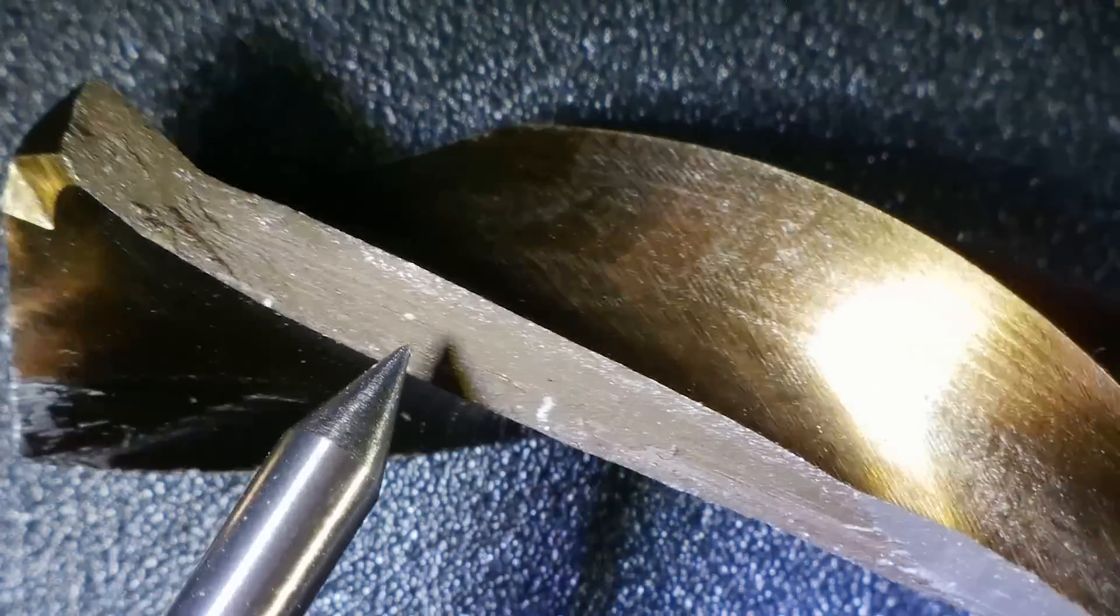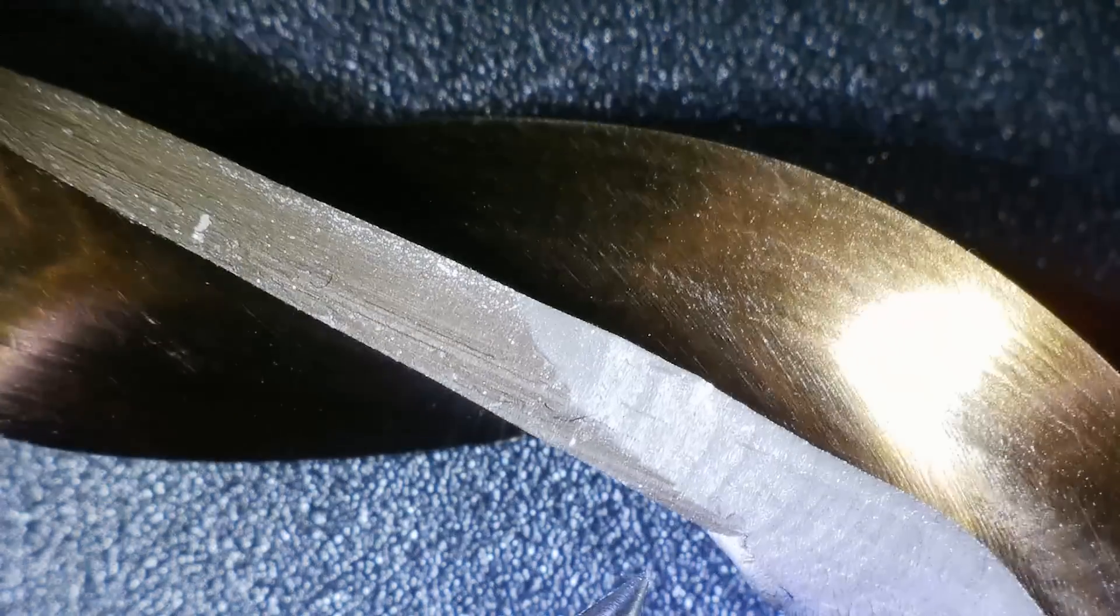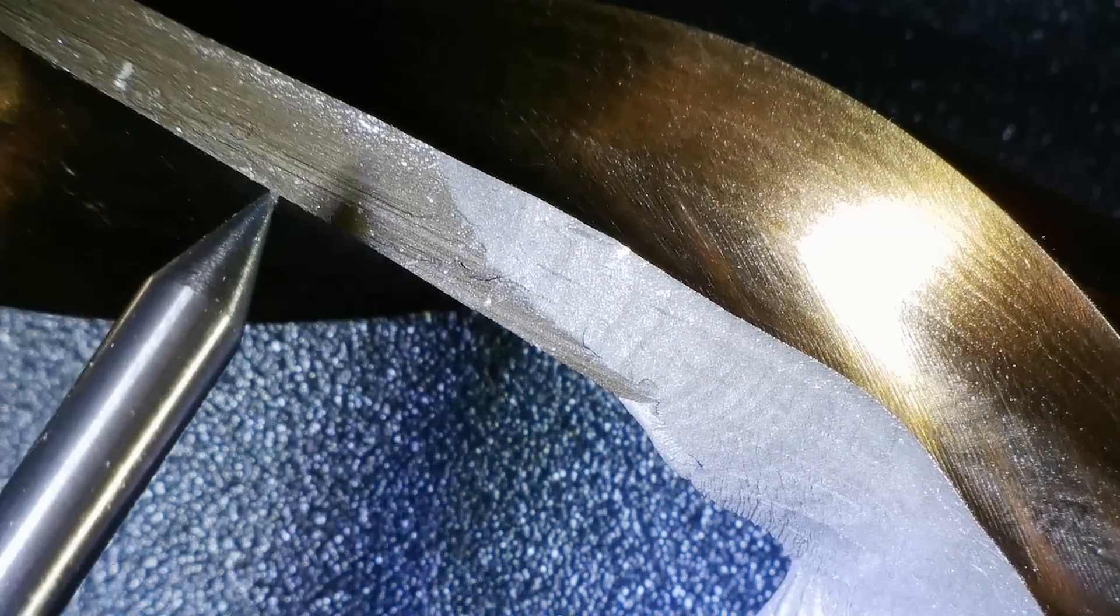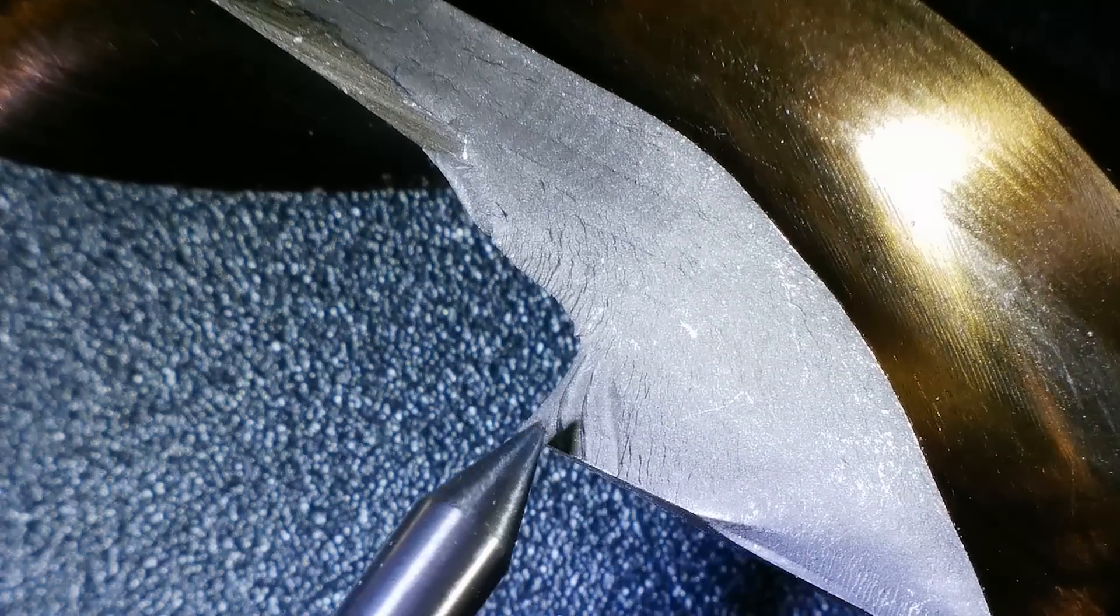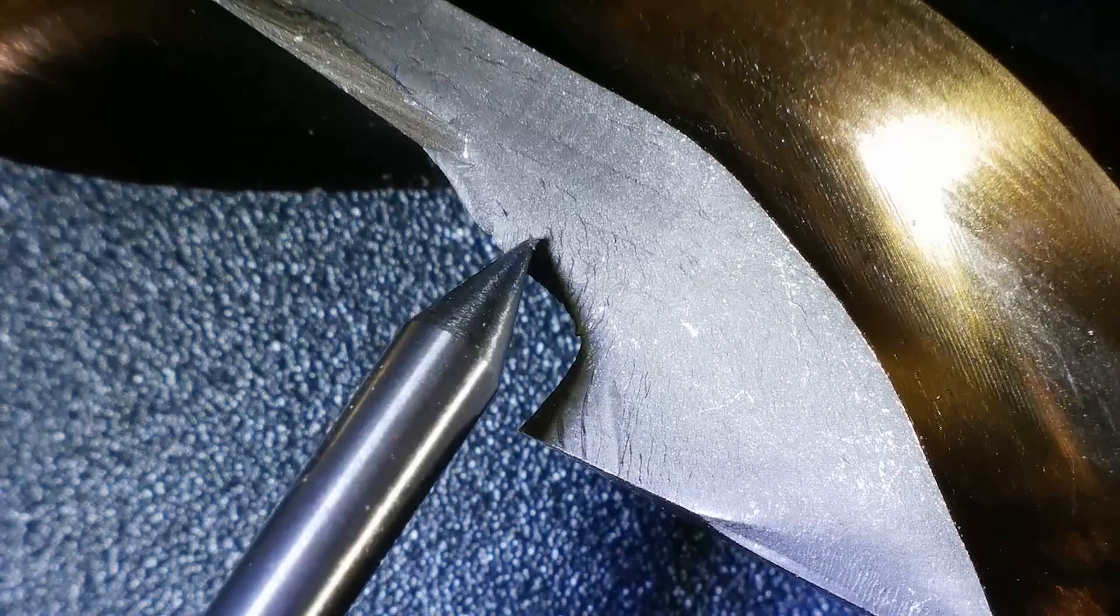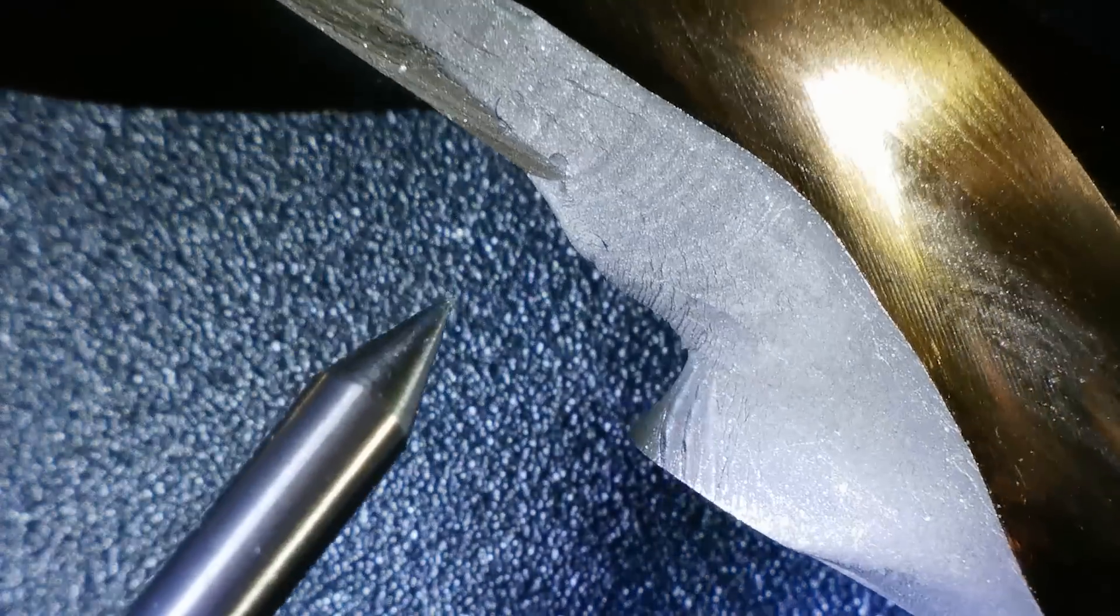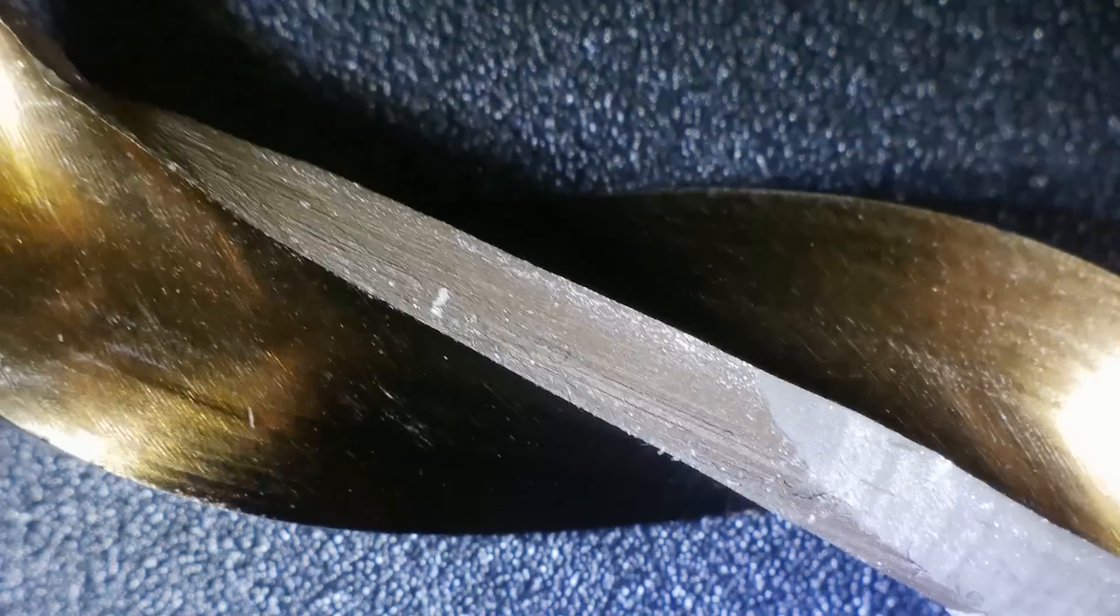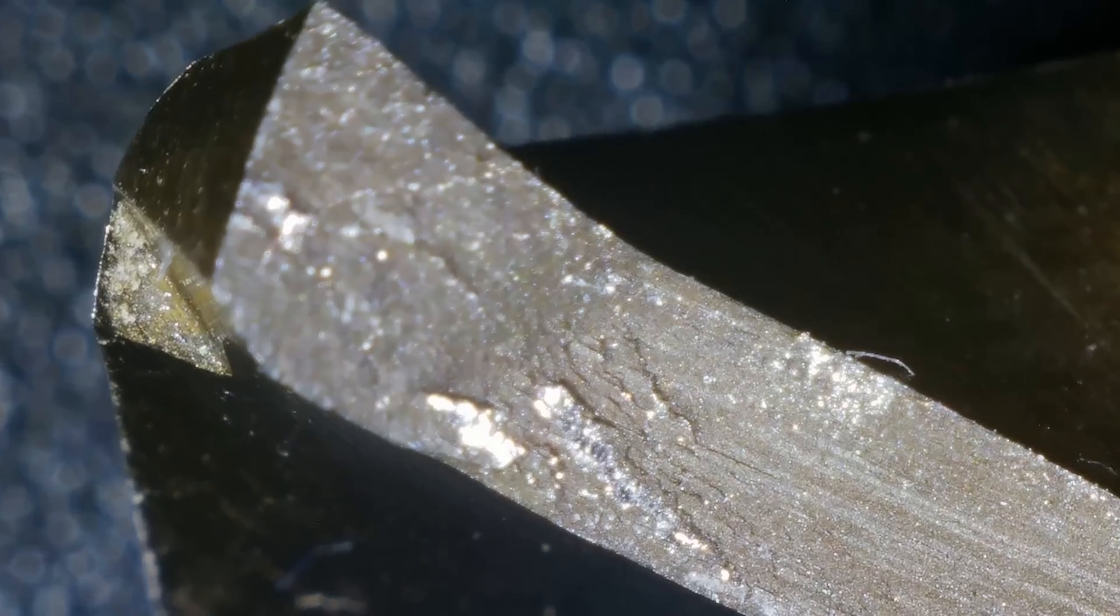It's really hard to tell just looking at it. We need more magnification. Under a digital soldering microscope that I have in the shop, we can see the texture here a little bit better. You can see the end of the drill that's got that dark color on it, and we can clearly see the dividing line to the brighter gray colored fracture surface. And not only can we see the color difference, you can see that the texture is very different. The dark area has these longitudinal ridges in the break that are moving lengthwise down the drill. And then once we get down into this lighter colored portion of the break, you can see the surface texture is very different. It's very grainy, has lots of little ridges and secondary cracking in it.